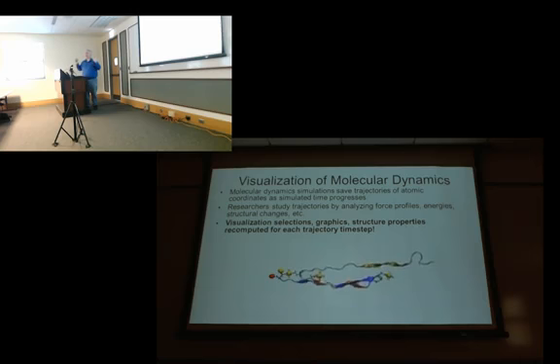If you make a spatial selection that is not necessarily true for all time steps, it'll give you a different part of the structure shown as the simulation progresses. Different atoms will be selected. This is something rather unique to VMD.